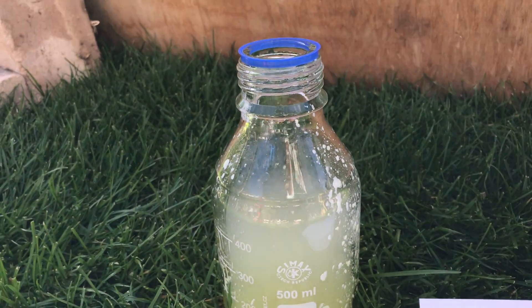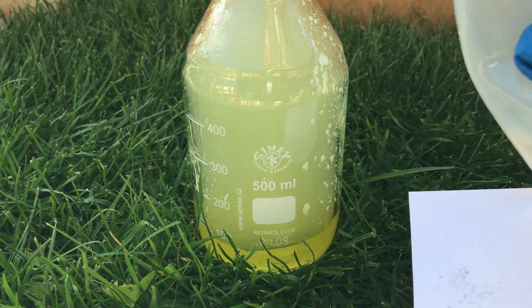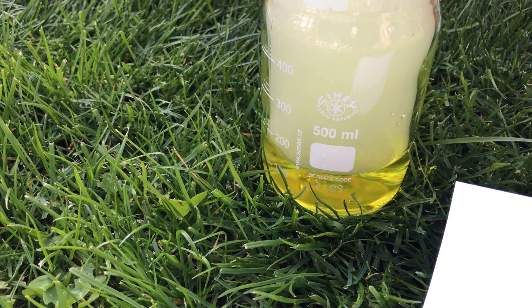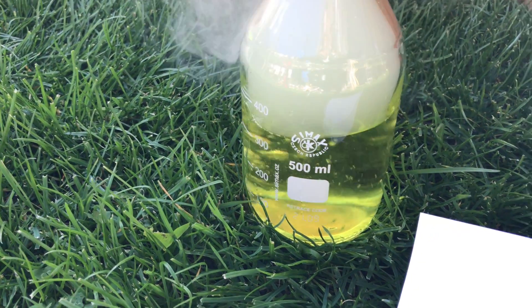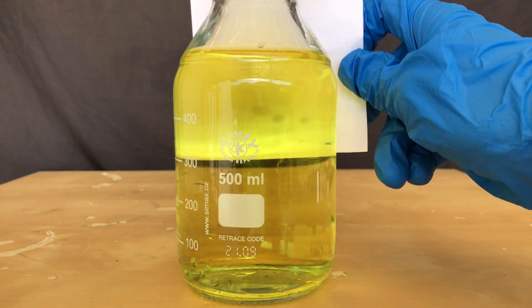I hadn't added that much hydrochloric acid yet, so there is a lot of leftover sodium chlorite in the bottle. Because I wanted to do a few experiments with chlorine dioxide solution, I added a lot of distilled water and even more hydrochloric acid. We are now left with a concentrated, beautiful yellow solution of chlorine dioxide.